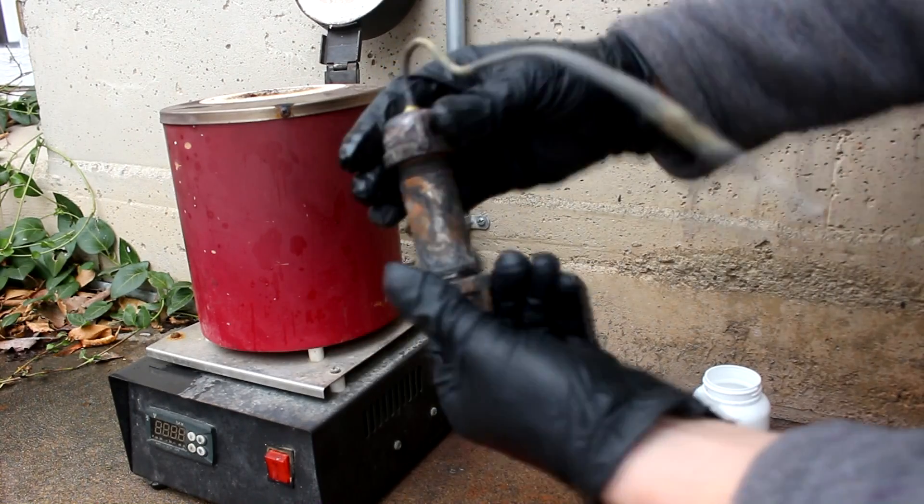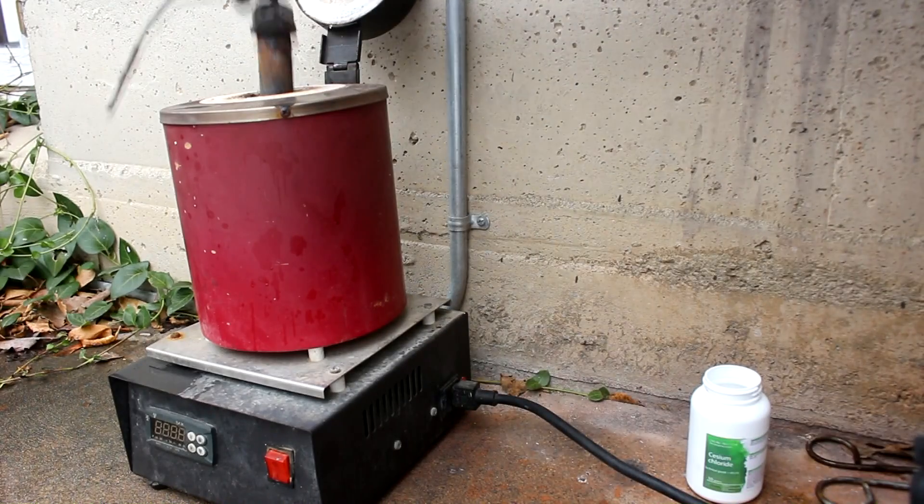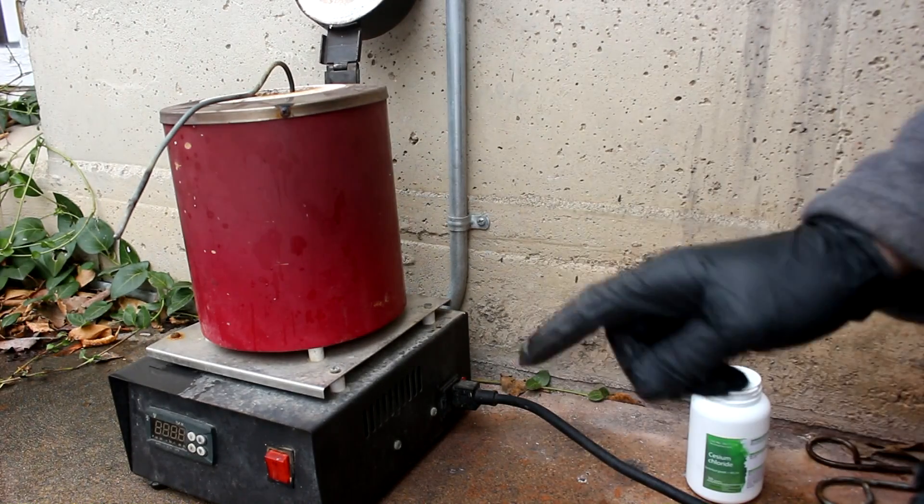Let's put it all together, put it in the furnace, heat to 1200 degrees, and hopefully we get some cesium.